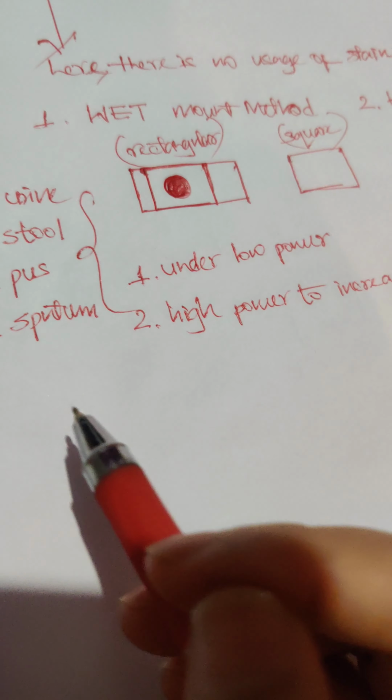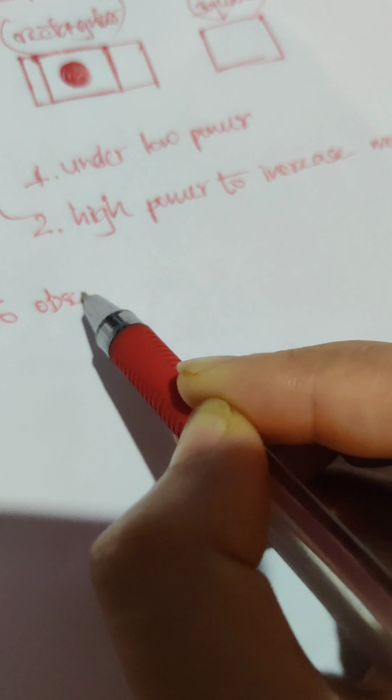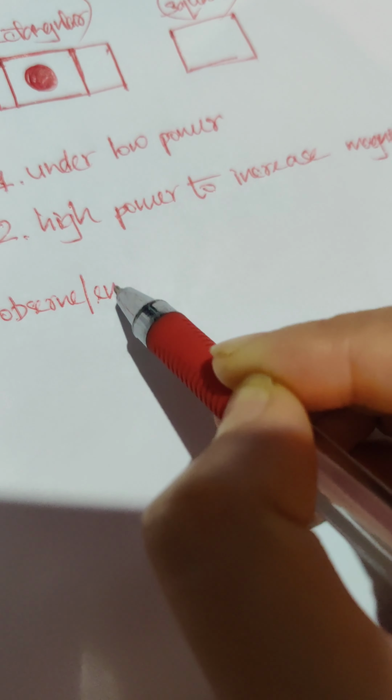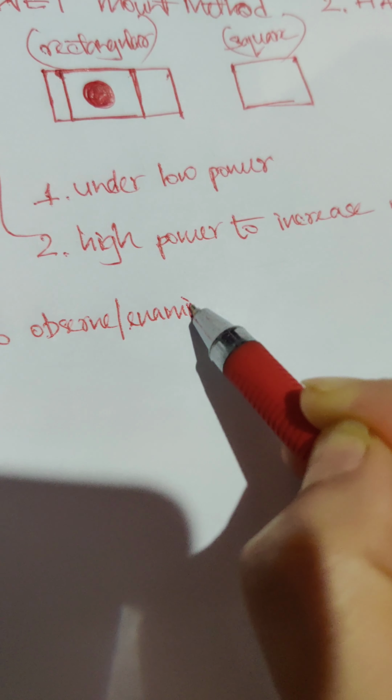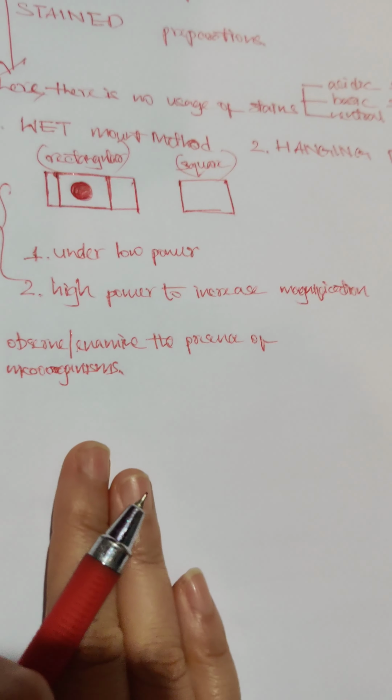So you're clear with your wet mount method. The use of the wet mount method is to examine the presence of particular microorganisms. So this is your wet mount technique.